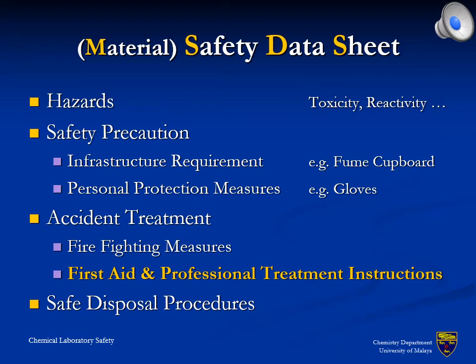MSDS, or SDS, of all chemicals inside a laboratory must be readily accessible. In case of any accident with chemical-based injuries, the MSDS needs to be provided to the medical doctor, to ensure a suitable treatment.